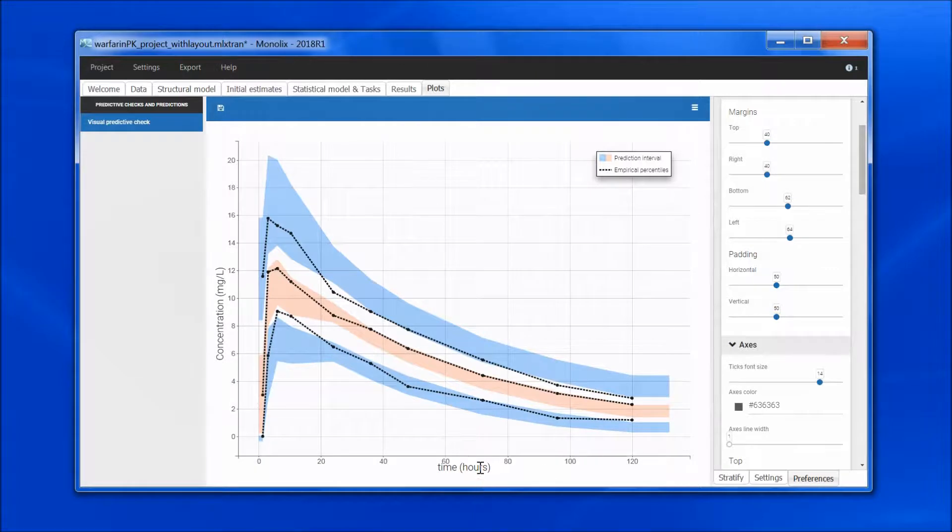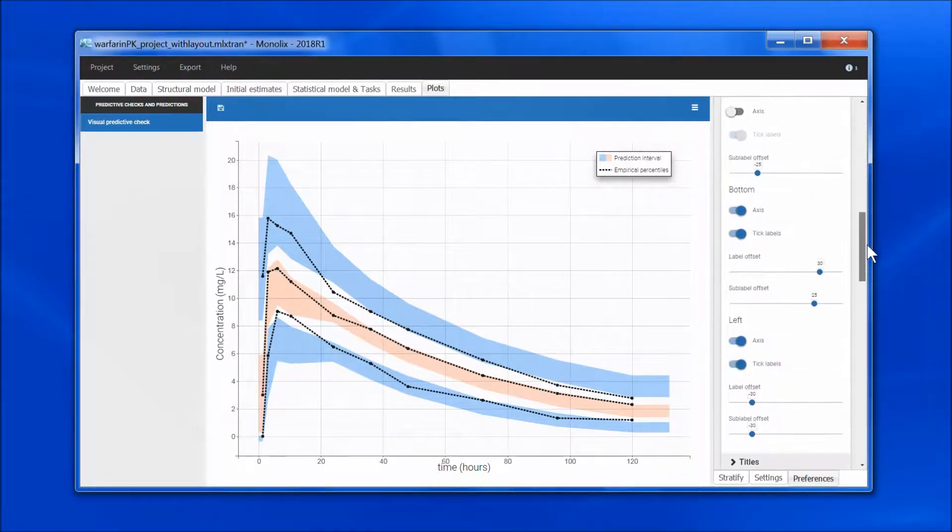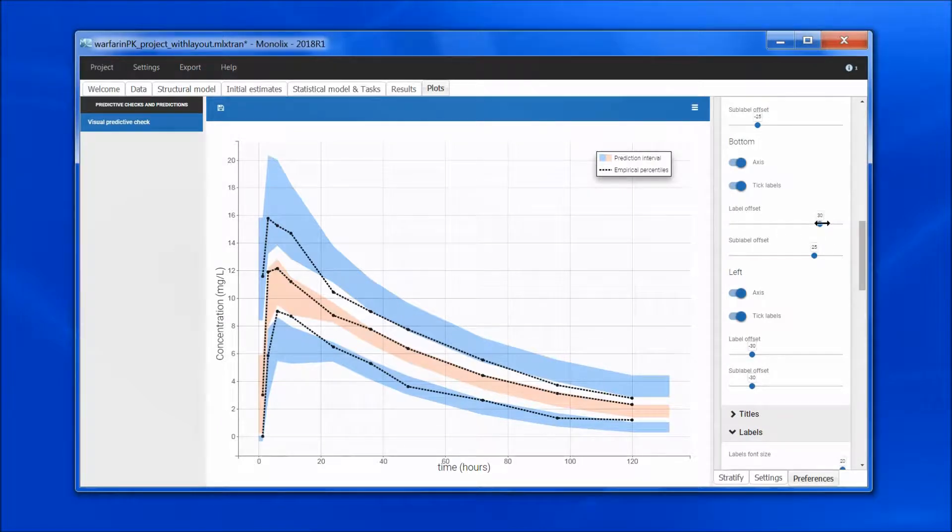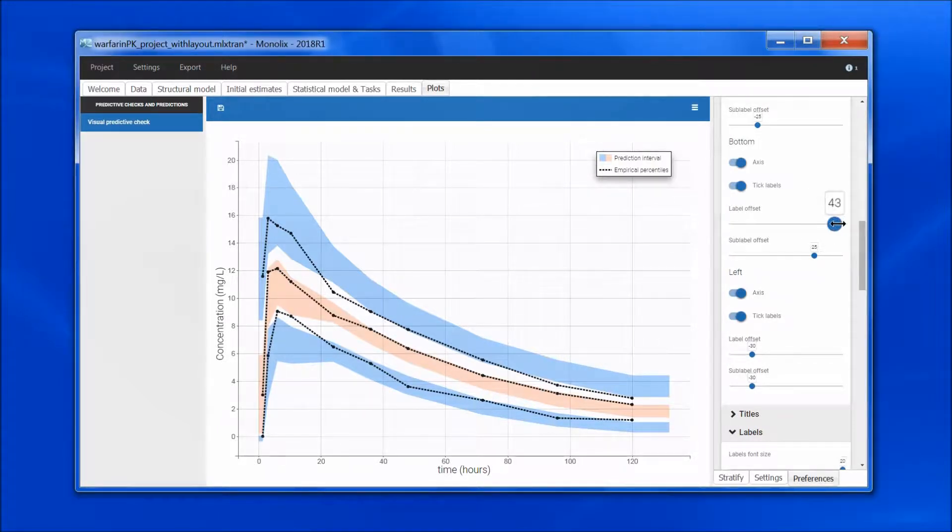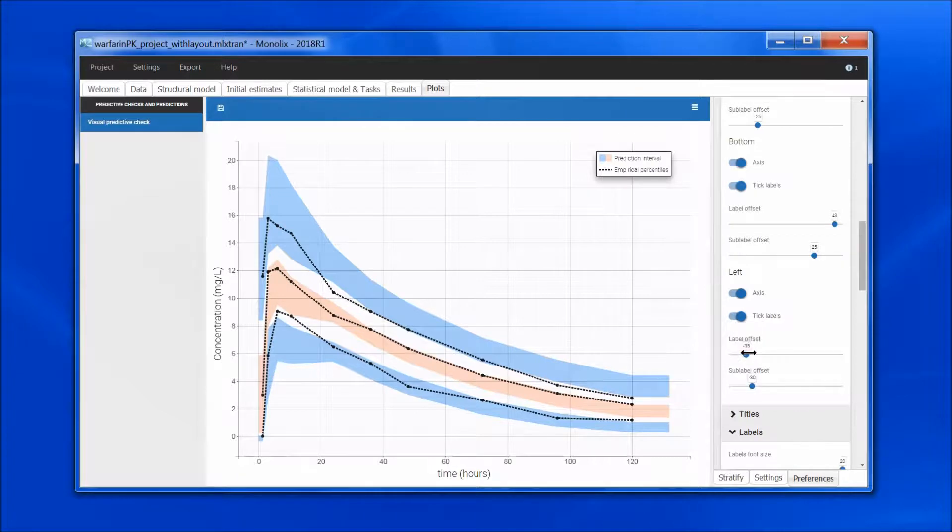Then I need to move the labels. I will do this here in the offset. So I am going to increase a bit the offset for the x-axis, and same here, I am going to decrease a bit the offset.